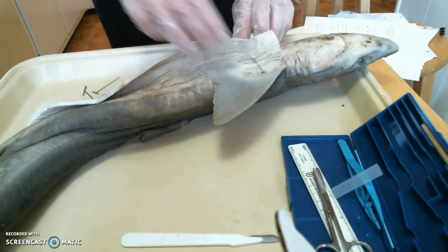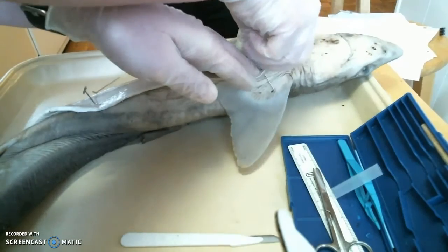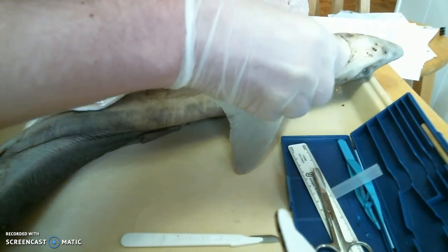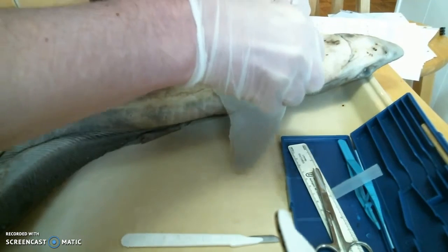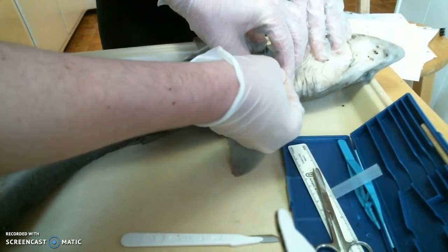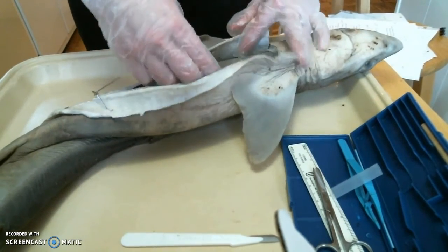Okay, well maybe I'll go. What do you think? Should I try to cut more by that pin? I would try pinning in a different direction. Okay, try that. See what you think. It's just really hard to cut right there, and we want to examine the gills later, so I don't want to damage the gills too much. But I kind of think I won't use the pins with the students, just because I think it ups the... See, it doesn't really hold... Yeah, it doesn't hold much. Alright, well, let's go from there.